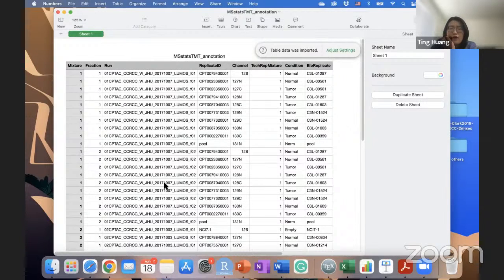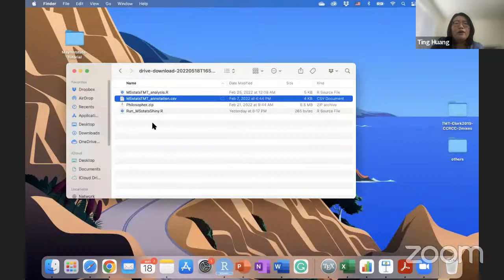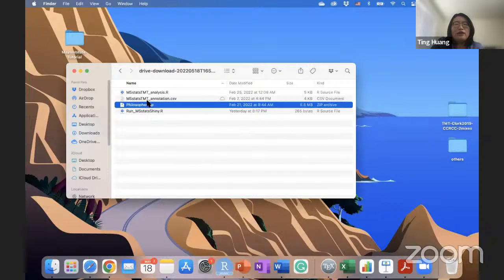I will talk in more detail later about how to prepare the annotation file. So currently, just assume you already have the annotation file, and then we will see how we continue the practice. In the second part of the hands-on, I will talk about how to prepare the annotation using different data set examples. So, okay, now we have the two data sets we want.